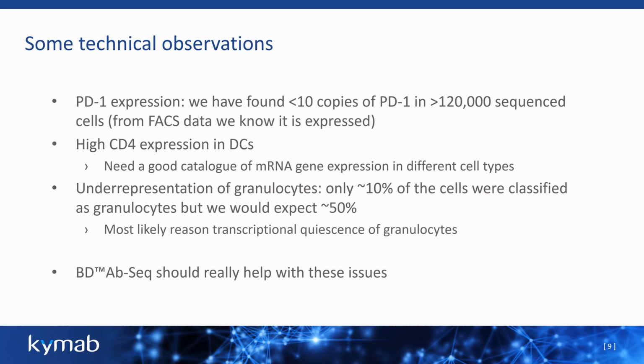I think that AbSeq, unfortunately this work was done before AbSeq was launched, will help with all of these points that I've raised because it just adds the protein part to the missing signals or information that we're just not getting from the mRNA.